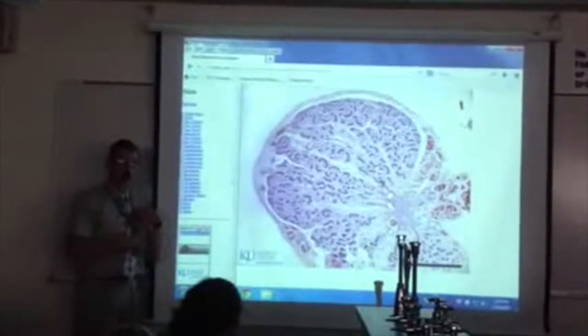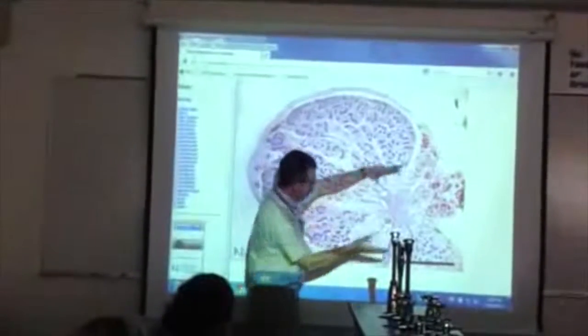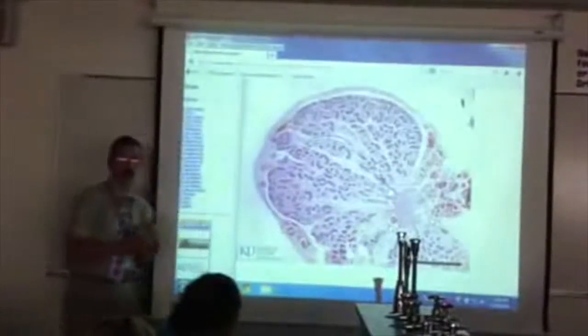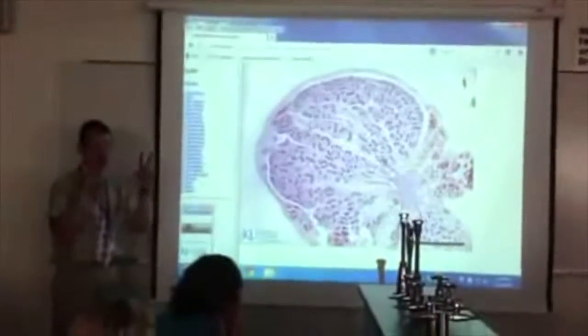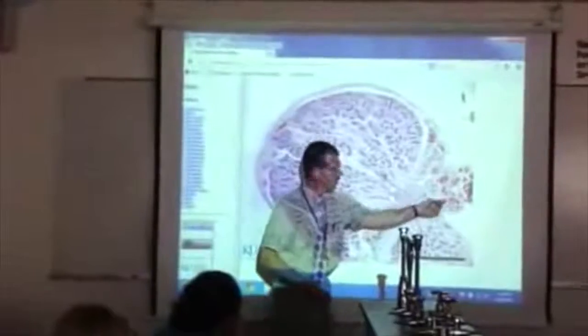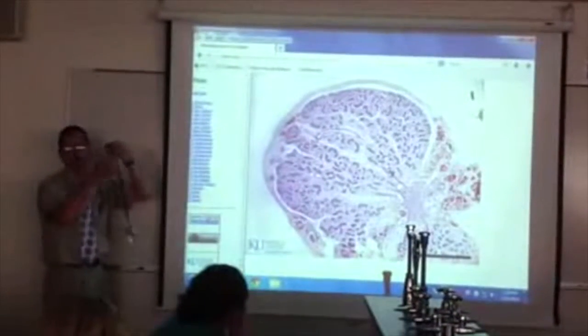You said the rete is netted. Is there something inside the net? Yeah, basically it's anything about here. Is it tissue, or is it still the tubules? Basically the tubes coil in the beginning and merge together, but it looks netted. It's the same. Basically, you're transitioning from this to that. Is there a word for the connection between the lobule and the rete? I'm sure there is. I don't know what it is.